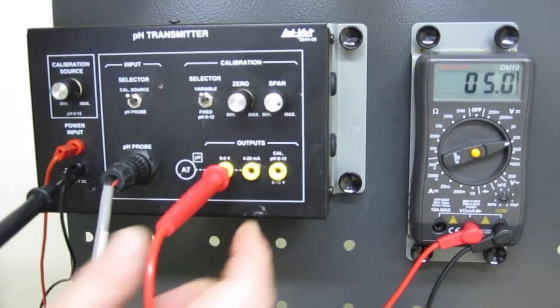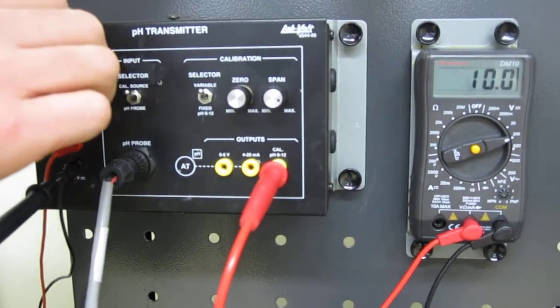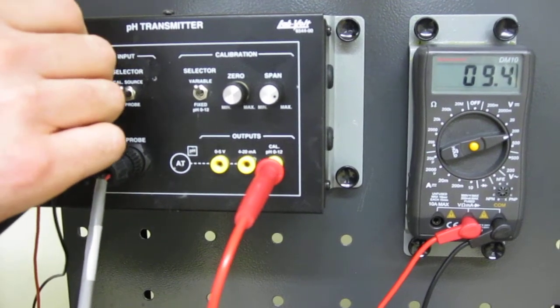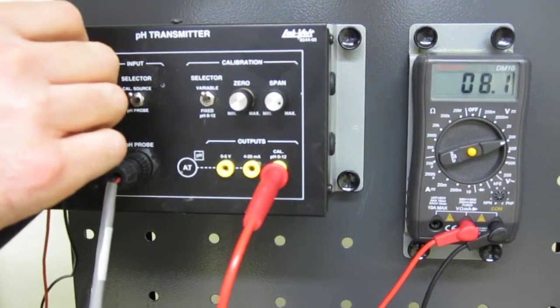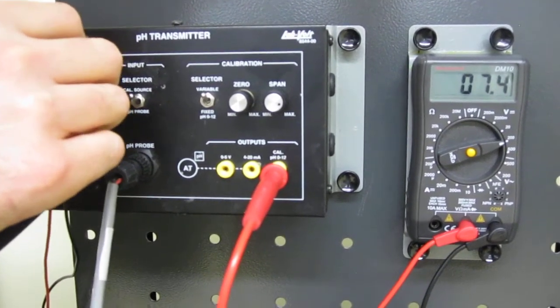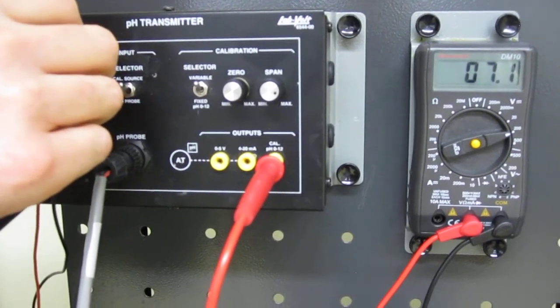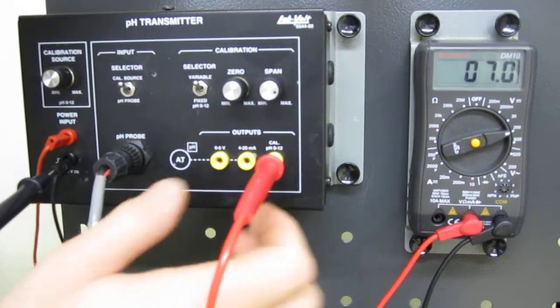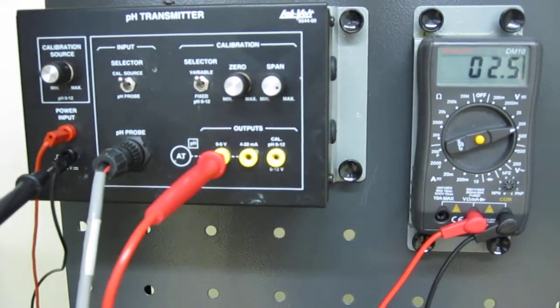Let's make a little test. If we have a pH of 7, the voltage expected should be 2.5 volts, as we saw on the blackboard. Let's see if my calibration is correct. And yes, it is.